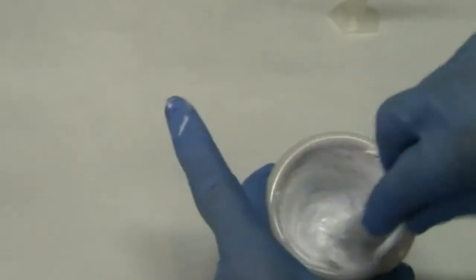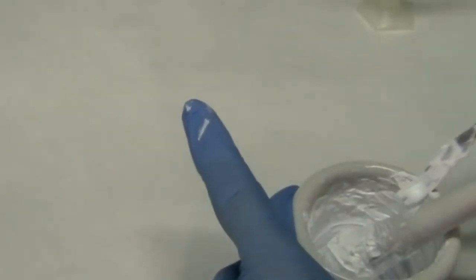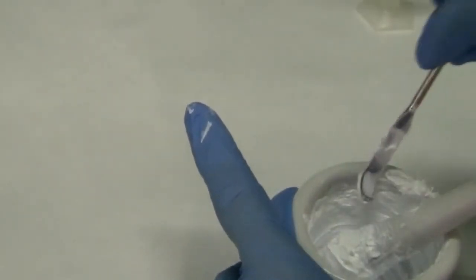Likely, at the end, the paste has the correct consistency, like a cream for hands. And after this, we can prepare for the deposition.